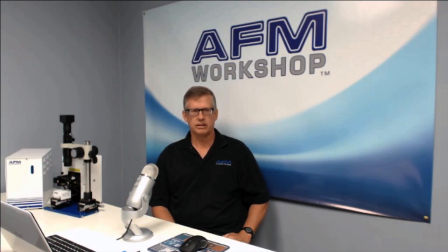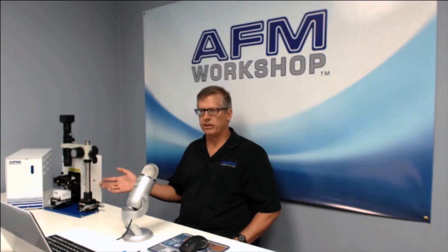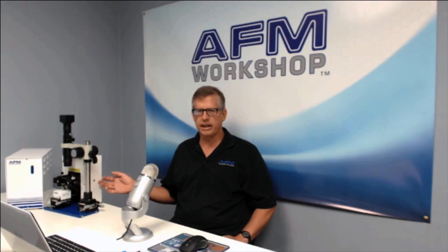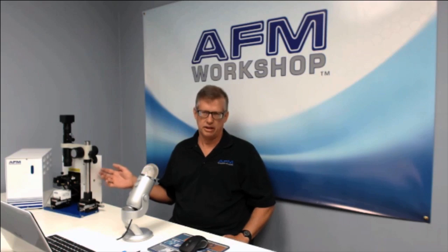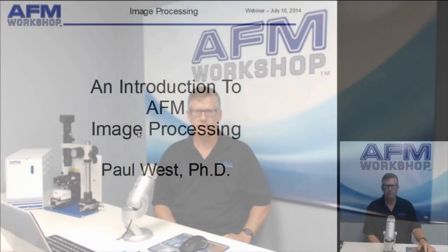During this presentation, we'll be talking a lot about Gwyddion software, which is a free software package that you can download from the internet. Gwyddion is a software package that comes with our TT-AFM, which I have right here next to me. The TT-AFM is a product which is designed for nanotechnology research, education, and instrument innovators.